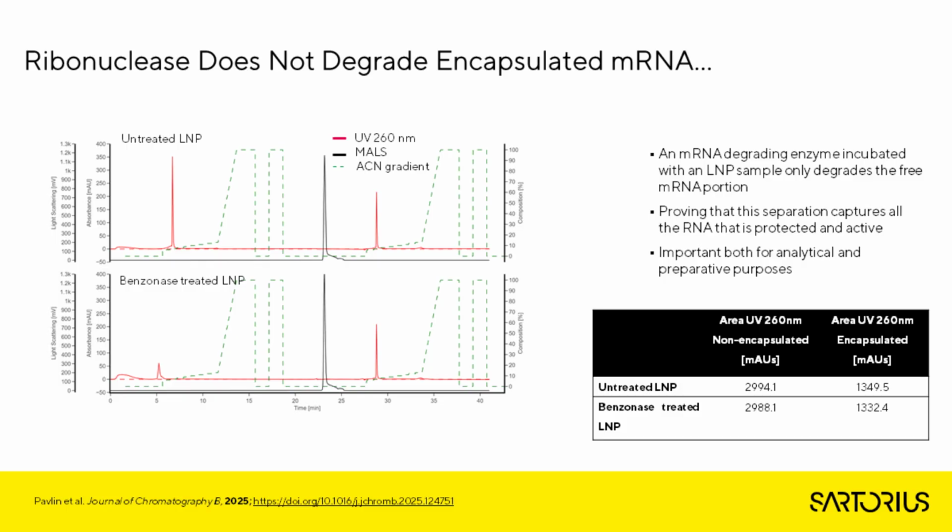Then the same sample was treated with benzonase, and as you can see, free mRNA was degraded, while everything that was encapsulated is still protected.